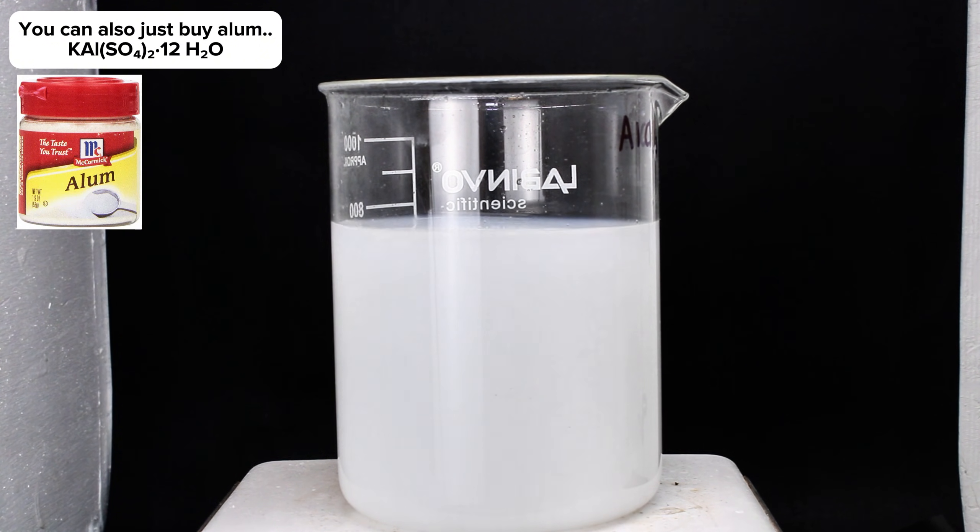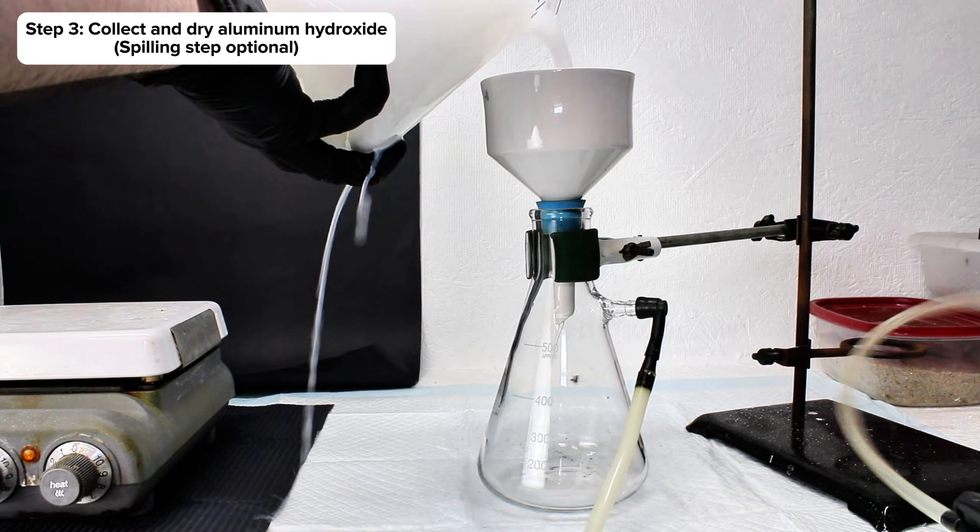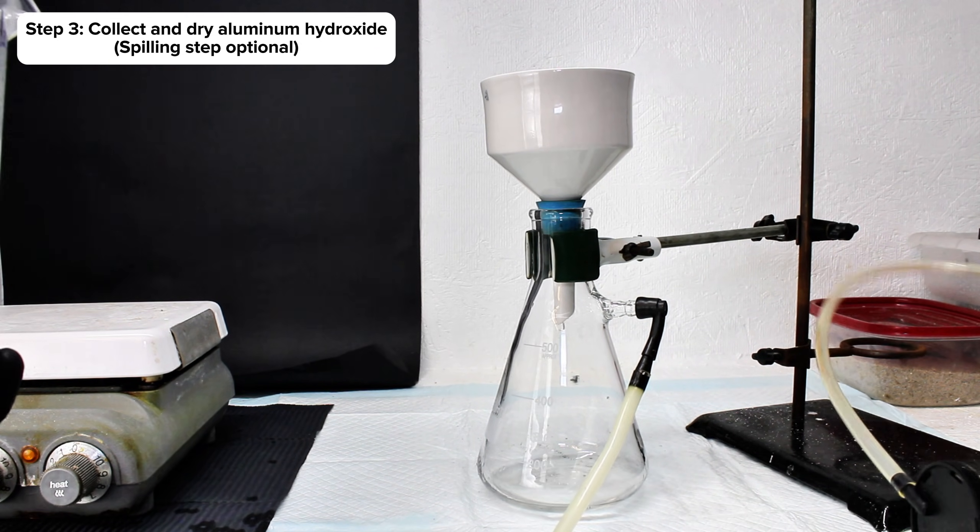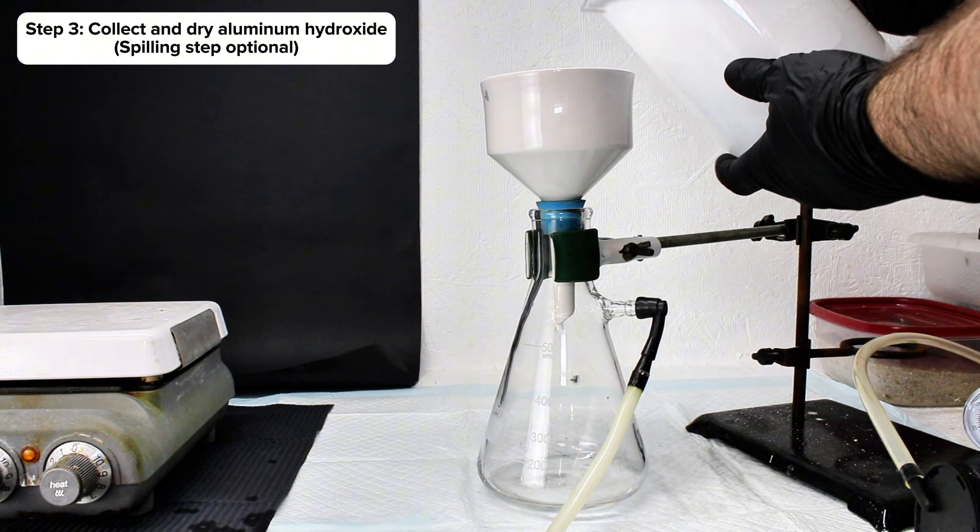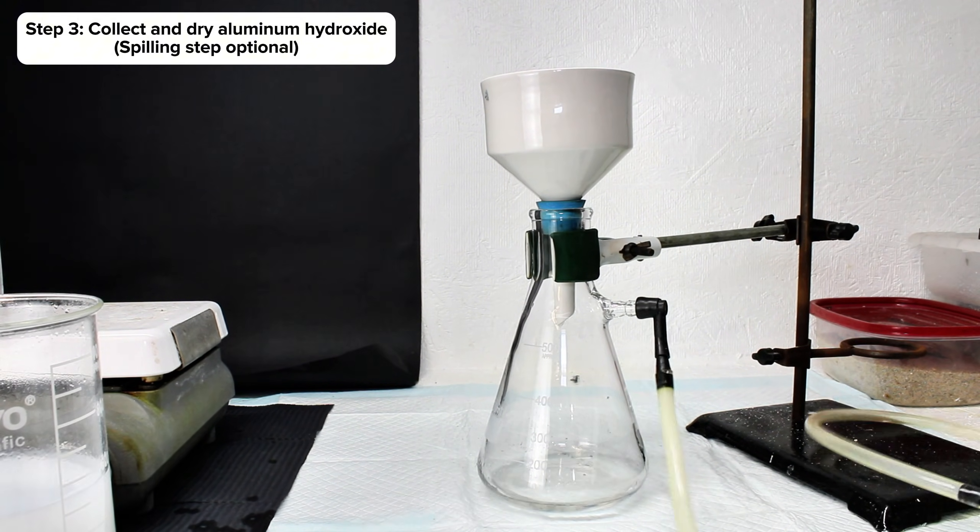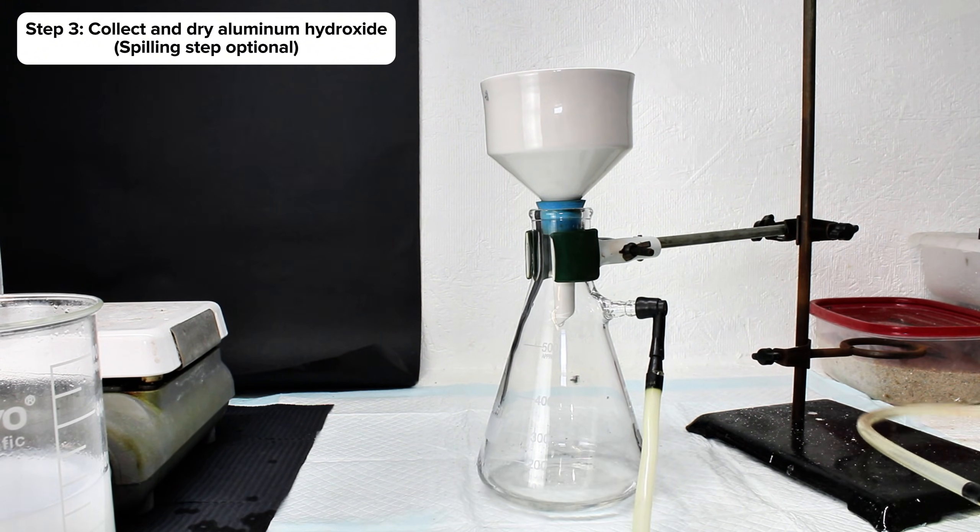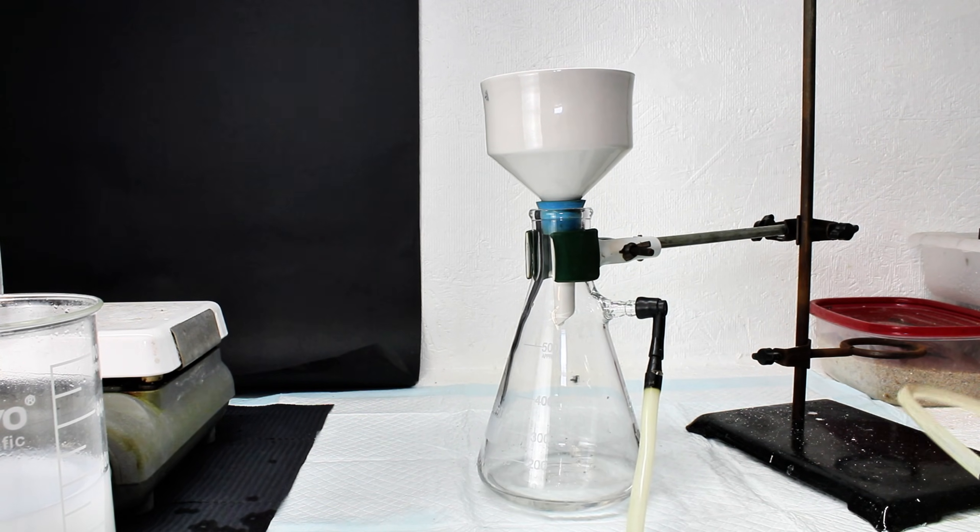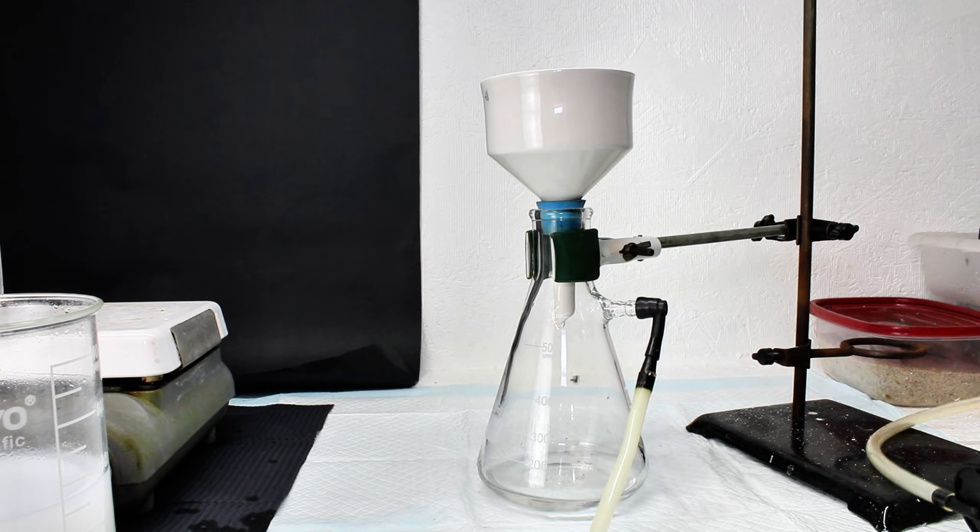Once all the aluminum hydroxide had precipitated, it was next collected by vacuum filtration. This process is pretty annoying due to the gelatinous consistency of aluminum hydroxide, but with enough patience, I was left with a thick slab of still very wet aluminum hydroxide.